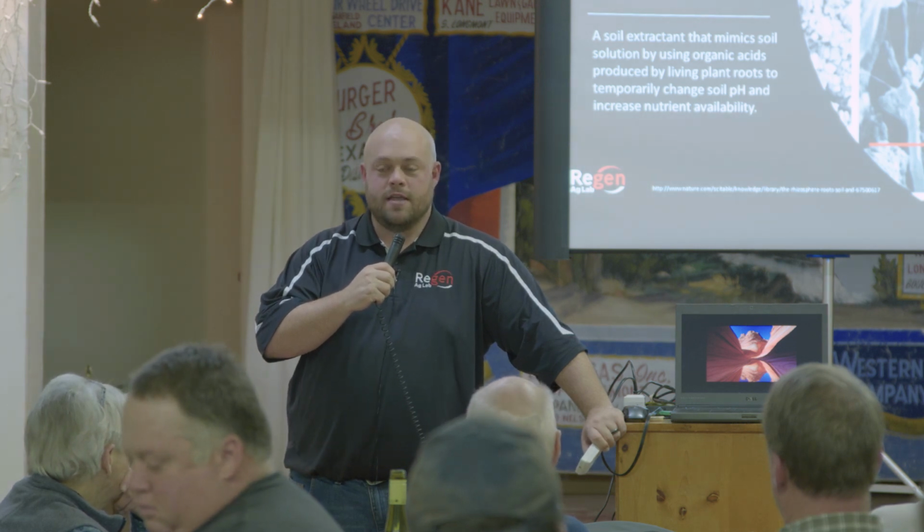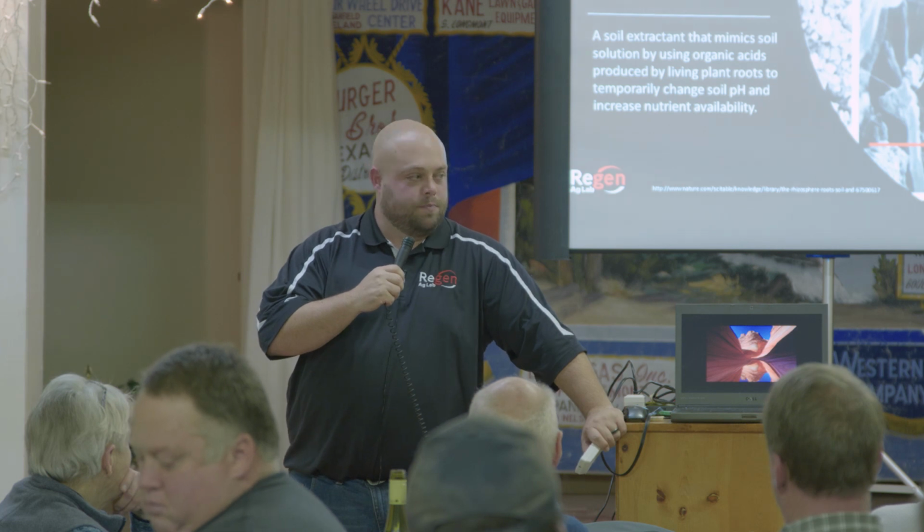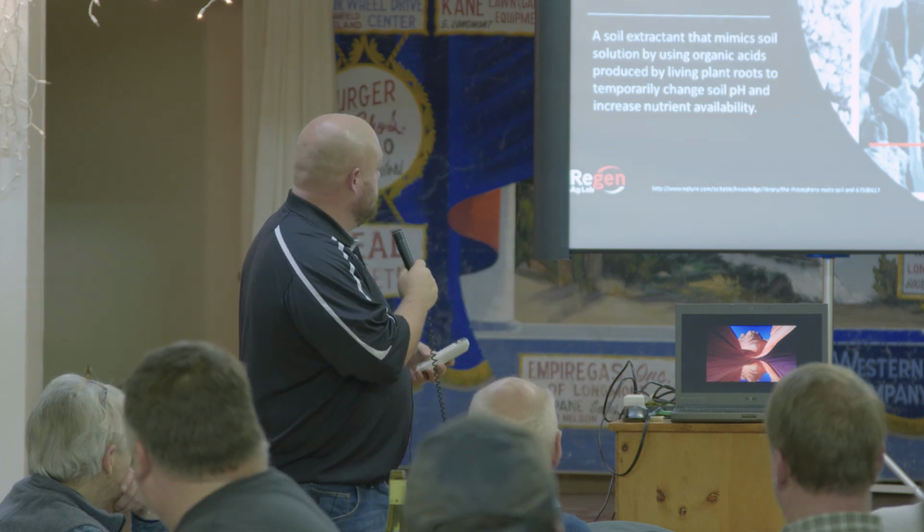Trust me, your soil will never ever be exposed to Mehlich 3 extracting solution anywhere other than a laboratory. And you better be really grateful that it's not. It's not saying it doesn't work. It's got its own applications and its own tools, but it's made up of ammonium nitrate, nitric acid, various bases, and it's got a pH of around 2.5. It's incredibly salty. You don't really want to spill it on yourself. It's pretty caustic stuff. You would not grow anything in your soil if it rained Mehlich 3, I can tell you that much. So the idea here, we're going to mimic this solution.